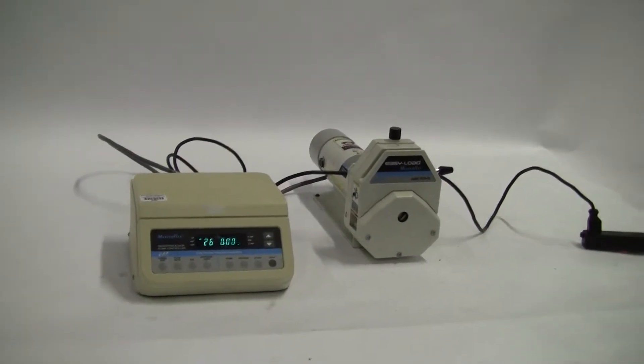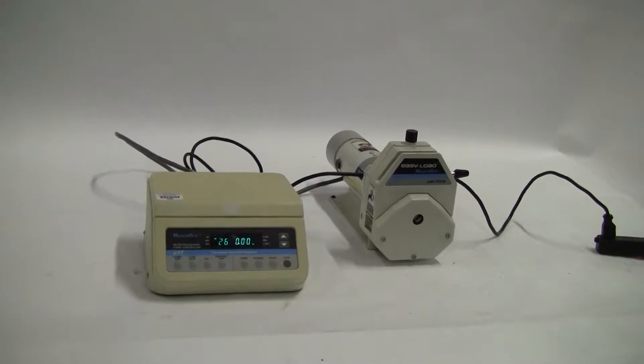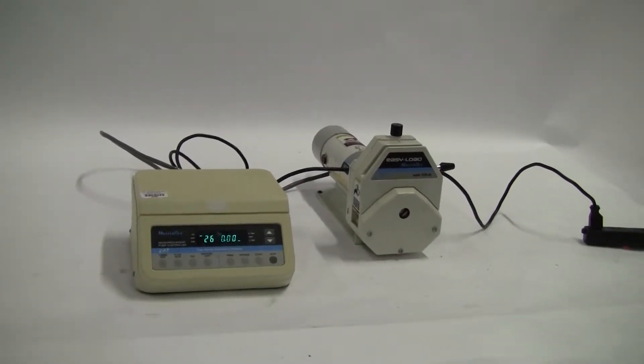Hi, this is Jim from HitechTrader. Today we're looking at a Kohl-Palmer MasterFlex peristaltic pump system.